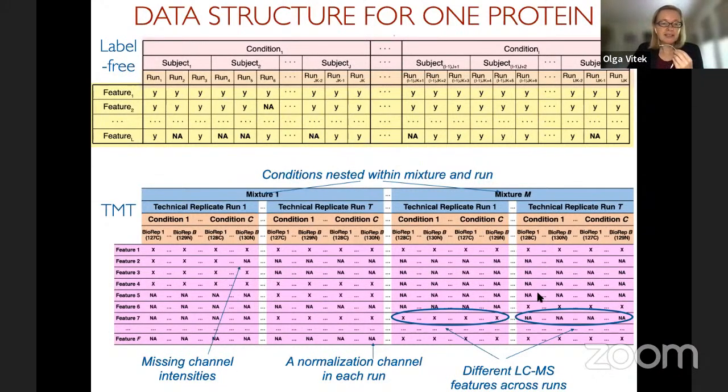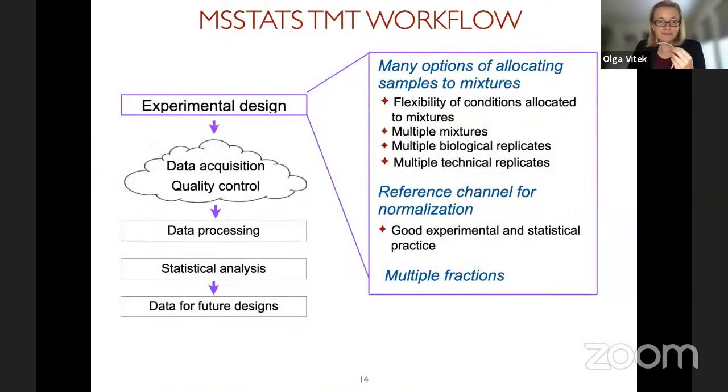So first of all, summarize the features and then make sure that the features are comparable, and then account for this orange and blue aspects of the experimental design to essentially build again the signal to noise ratio to understand what's the appropriate signal, what's the appropriate noise, and whether yes or no, the signal to noise is higher than we expect by random chance. So that's really the work. And we will mirror the same workflow as in label-free, but with modifications.